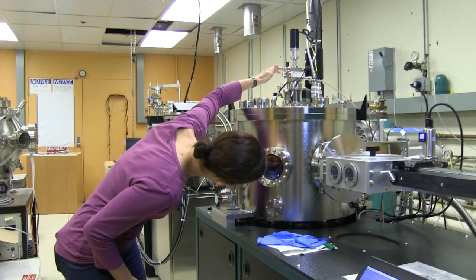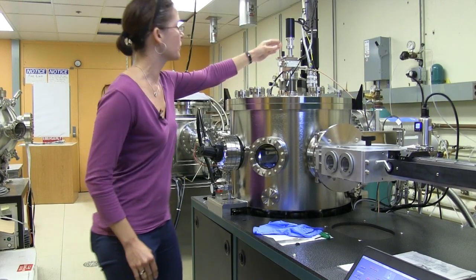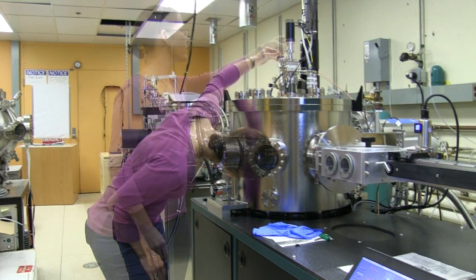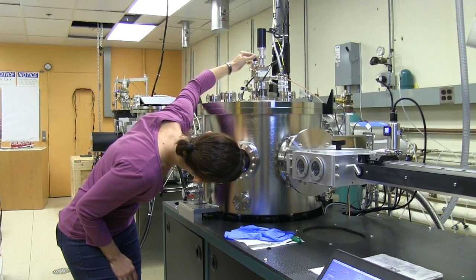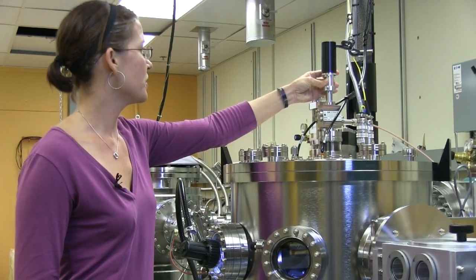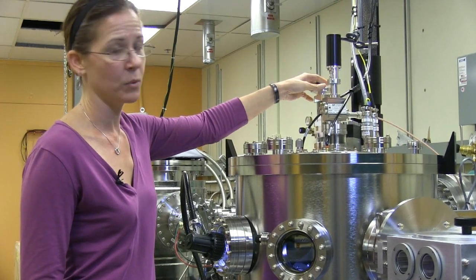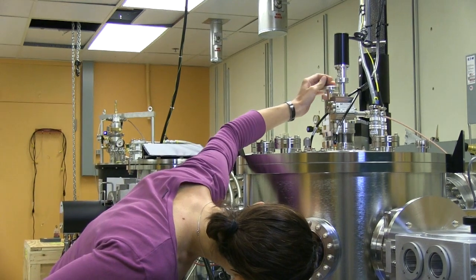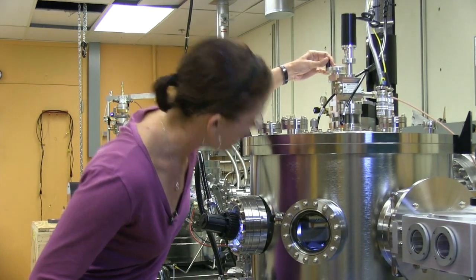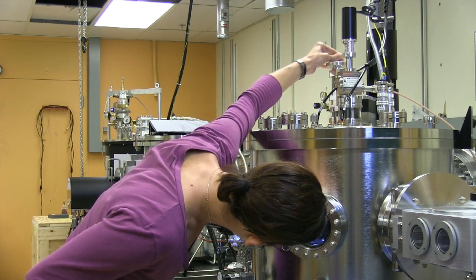So now that that's in there, I'm going to go ahead and take a look and make sure everything is lined up correctly — which it's not quite. So now I'm just bringing the sample holder down, and then if I rotate it in this direction, that should unhook the sample holder.